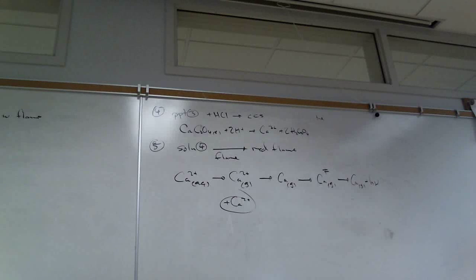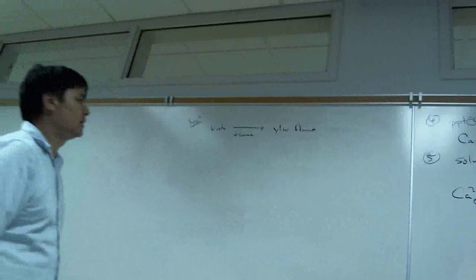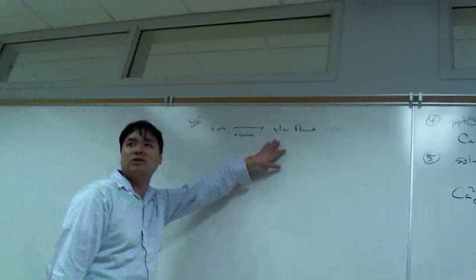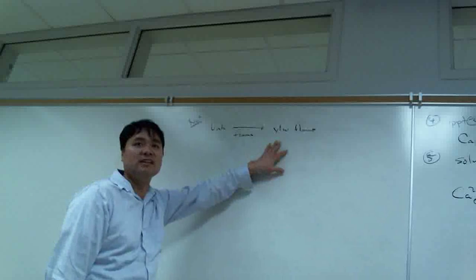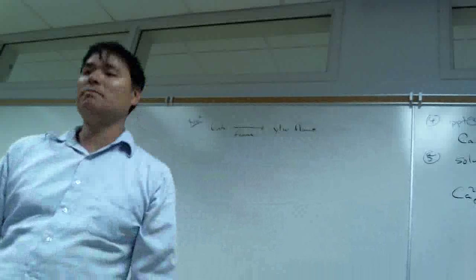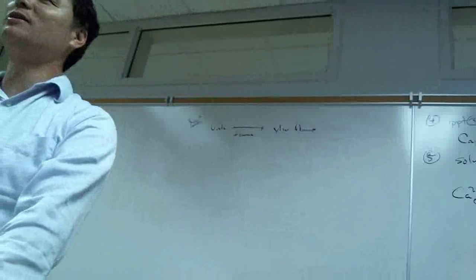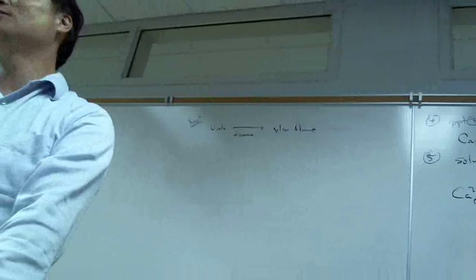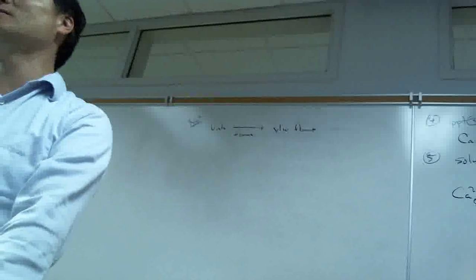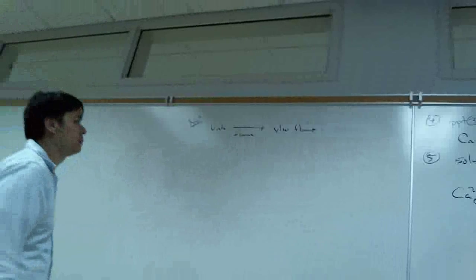We've been having some contamination issues. People have been telling me that there are people in this lab with very sloppy technique that are contaminating various solutions with their droppers. So be careful, because contamination will yield the yellow flame. And it's easy. You can contaminate it with your fingers. For example, if you spend all this time cleaning that platinum, and then touch it when it's hot, you'll get burned. But if you let it cool down and touch it with your fingers, you're going to spend another 30 minutes cleaning the sodium you just left from your fingers off that platinum wire.